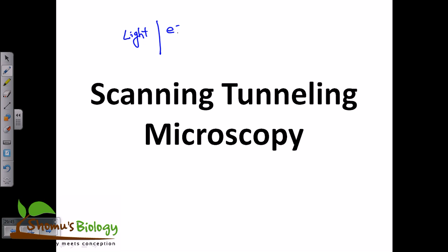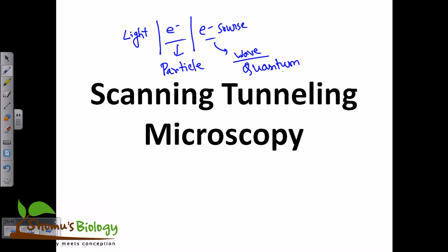Now in the case of scanning tunneling microscopy, we are also using electrons as a source, but remember here, the electron that we use in electron microscopy behaves like a particle, just like the classical phenomena of physics. But the electron that we use in scanning tunneling microscopy behaves like a wave. So this is called quantum mechanics. The principle that we use in scanning tunneling microscopy is about the quantum tunneling effect, the law of quantum physics, right?